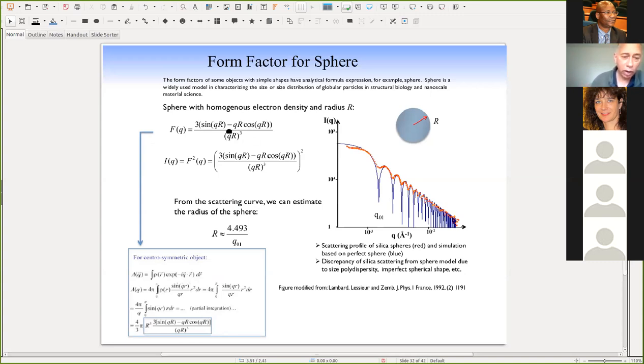And by the way, you can do the various Fourier transforms of different things. Let me show you one more. And he even does it here. So you take that function and try to fit it to your structure, and then you can extract the average size of those spheres in your fluid. This is getting increasingly used in structural biology, actually. On one beam line, they'll have this floppy stuff and try to do the diffraction from it, but then they'll bring it over to the SAXS beam line and try to get the overall outside shape of the molecule. So that's an example of SAXS. Okay, move on.